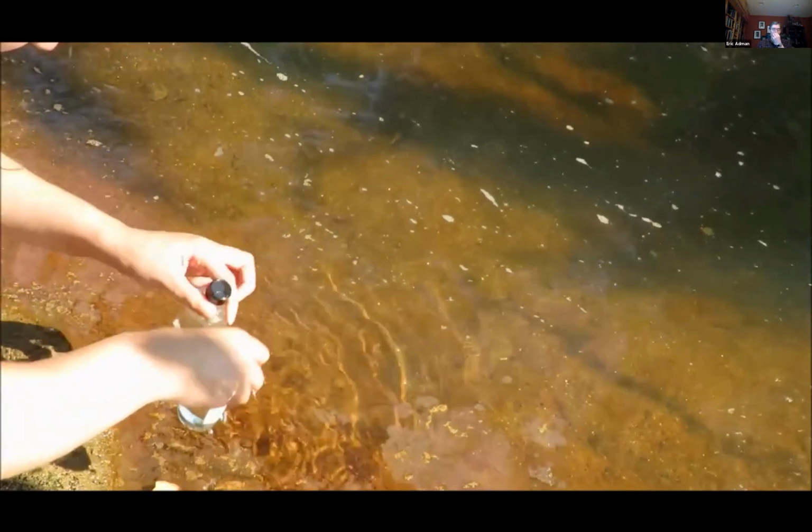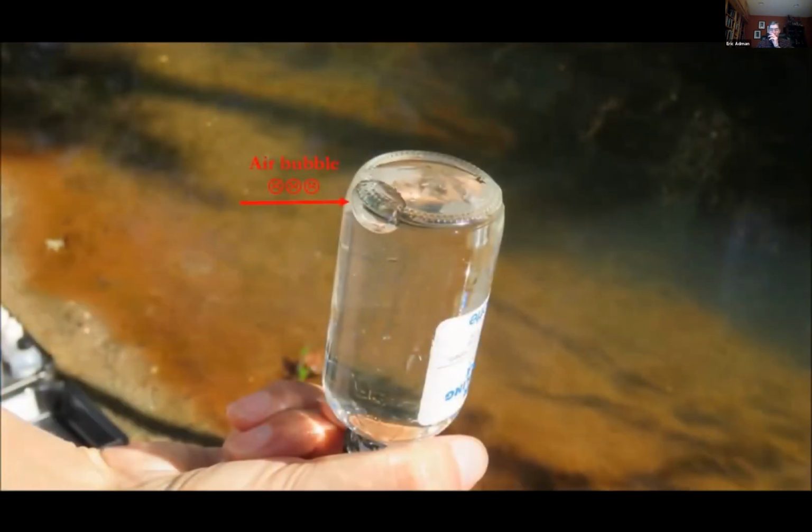Remove the capped bottles from the water and invert them to make sure no air bubbles are trapped inside. If air bubbles are present, even if they are only in one bottle, empty both sample bottles and refill them with water again. Once a satisfactory sample has been collected, proceed immediately with the next steps.